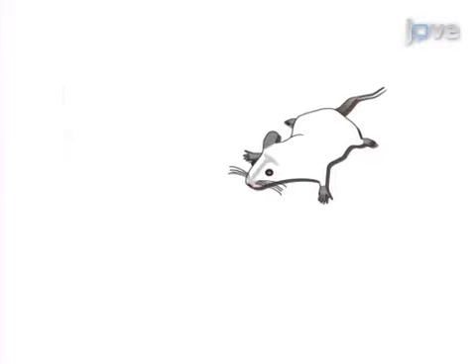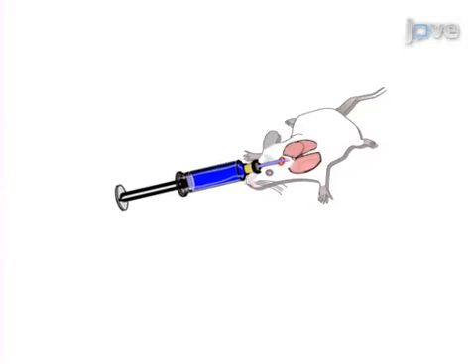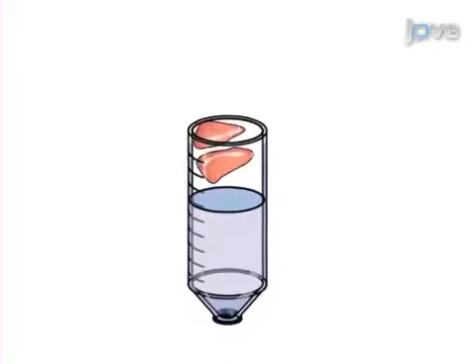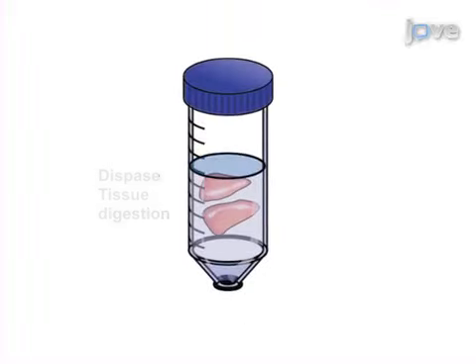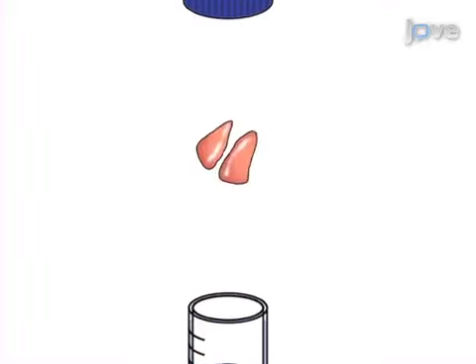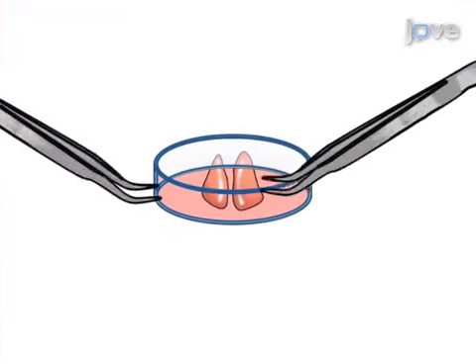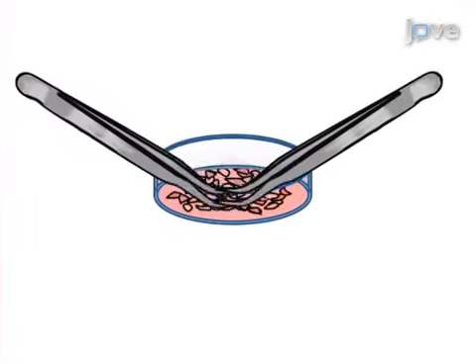First, the lung and trachea of a sacrificed mouse are instilled with a solution of dispase and then agarose. The lung is then removed. After the dispase is allowed to digest the lung, the tissue is manually disintegrated.